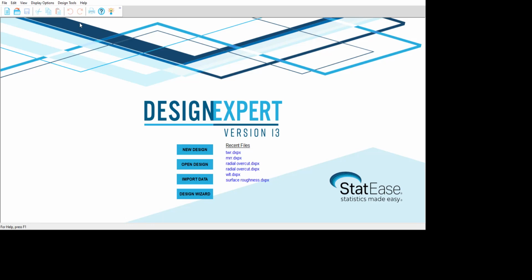Hello all, I am Dr. Rizvi and today in this video we will learn how to develop a response surface model for three factors having 20 experiments. So let us start with our video.